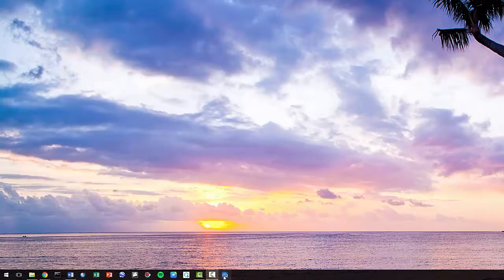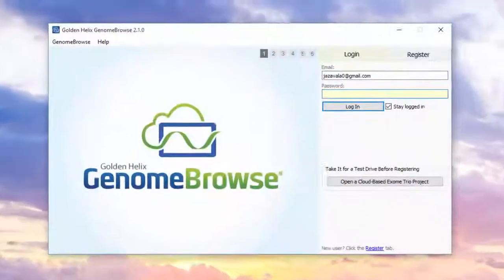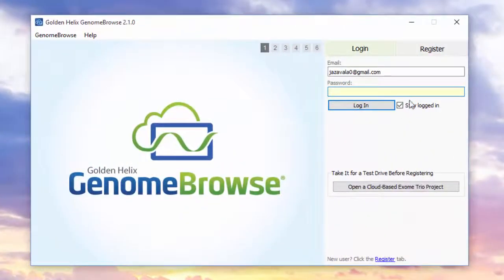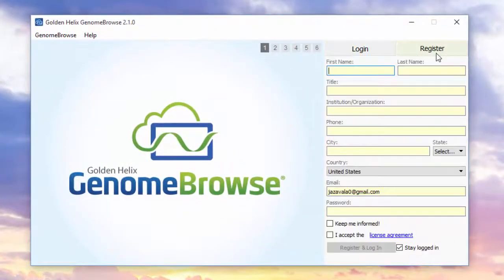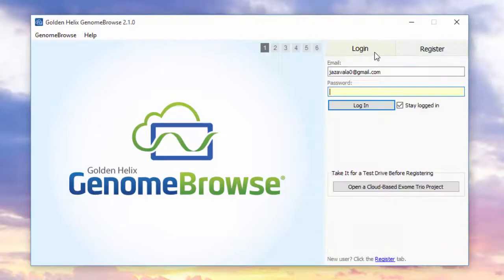Launch Genome Browse. You'll have to register an account with Golden Helix. Once you do, type in your password and log in.